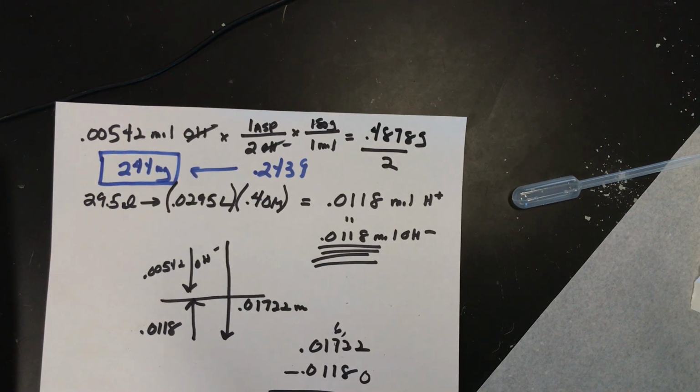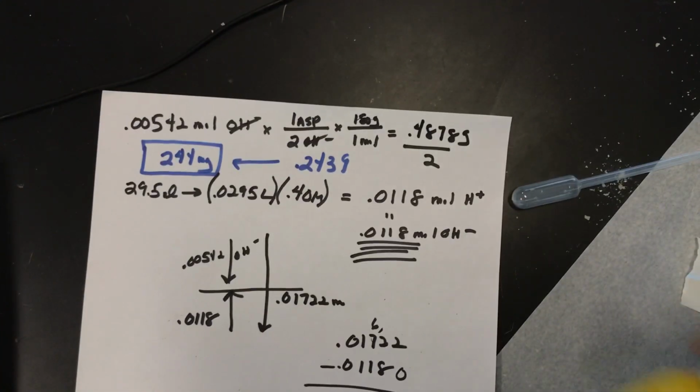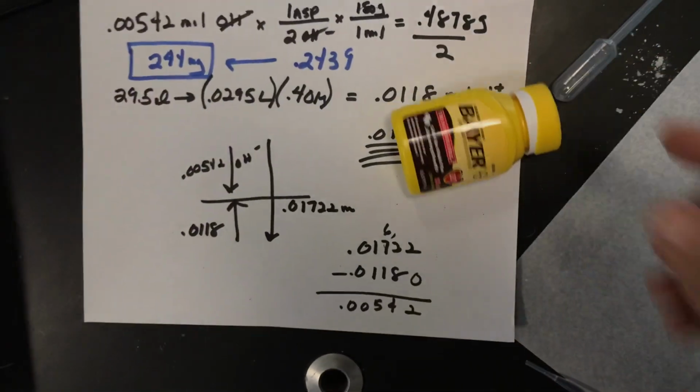And that is your value for what's in that tablet. Target was 320. You got 244. But that's what our titration shows, and that is very possible. So we're under by about 80 milligrams than what the label is saying. I'm interested to see what the other students get, but there it is right there. That's your lab. A lot of work to get to that point.